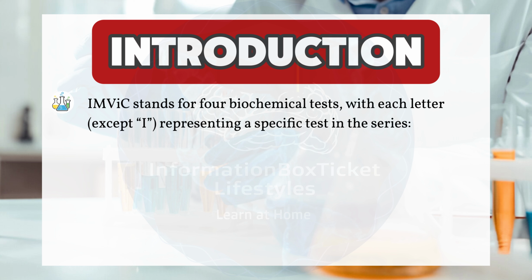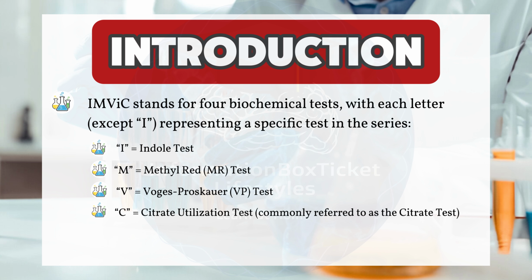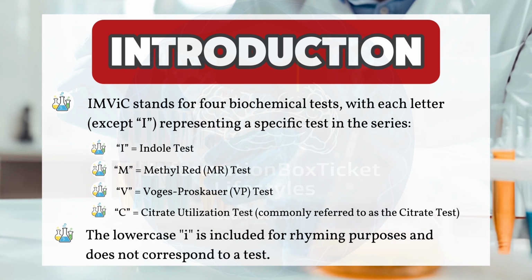IMViC stands for 4 biochemical tests, with each letter, except I, representing a specific test in the series. I = Indole Test. M = Methyl Red test. V = Voges-Proskauer test. C = Citrate Utilization test, commonly referred to as the Citrate test. The lowercase I is included for rhyming purposes and does not correspond to a test.